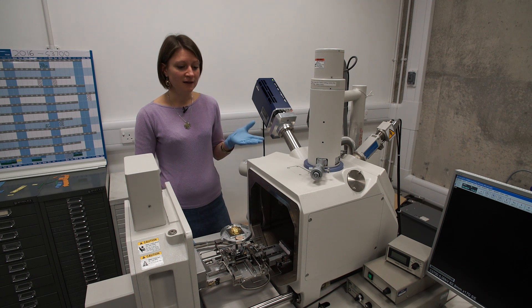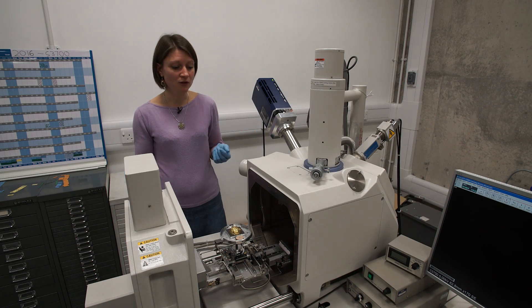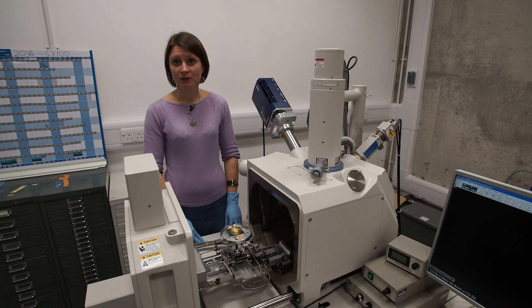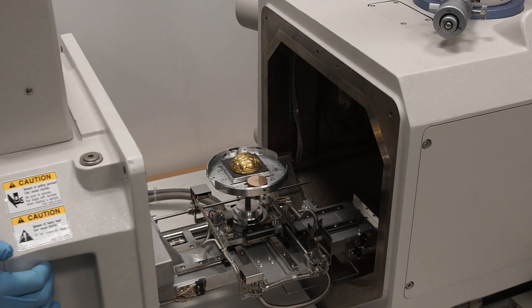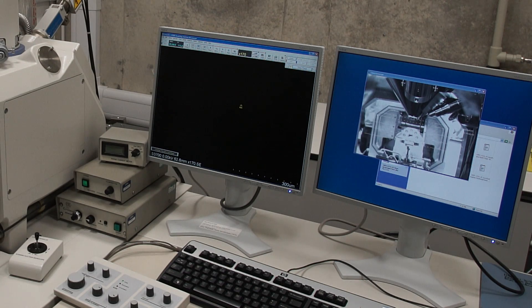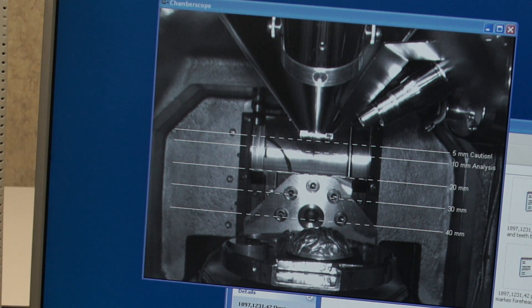I am using the scanning electron microscope — variable pressure scanning electron microscope — which allows us to study objects and to analyze them as well. Here I will now push the door. We can know the position of the object at all times thanks to the infrared camera within the chamber.